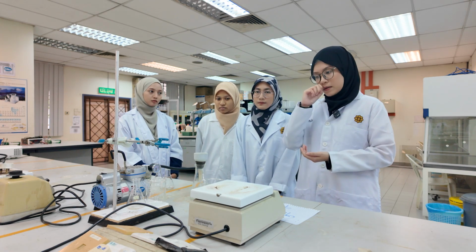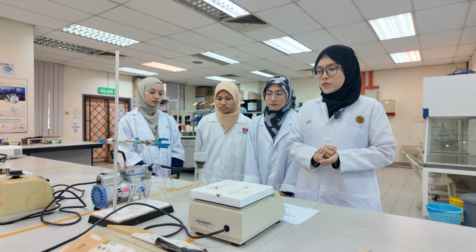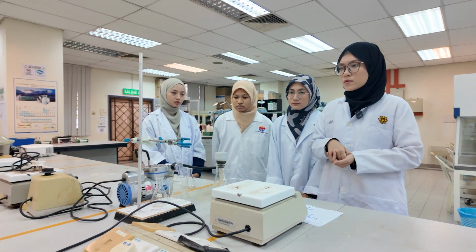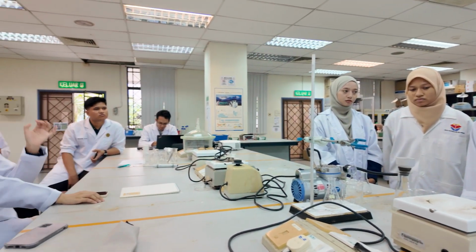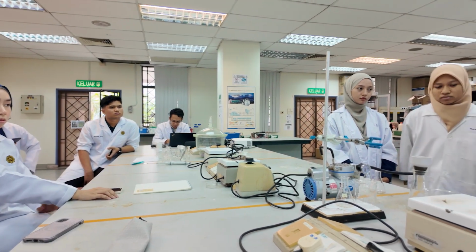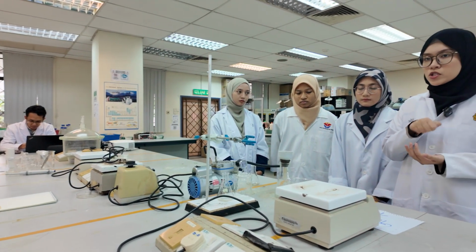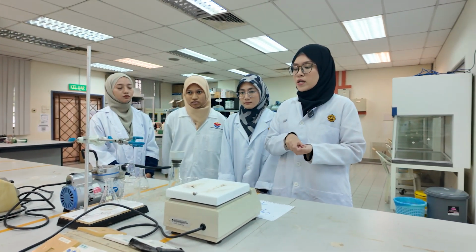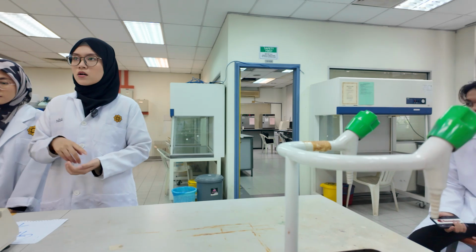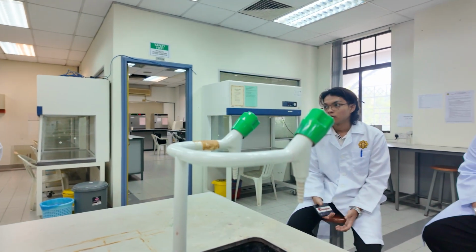During the experiment, we dissolve the compound in hot solvent, and then we cool it slowly at room temperature, and we divide it into 2 flasks. The first flask we cool at room temperature, and the second flask we cool in the ice bath to encourage it to form crystals.